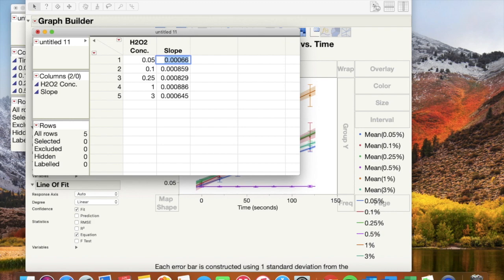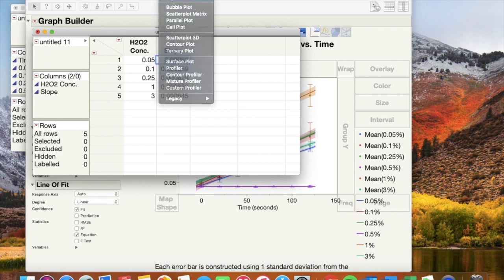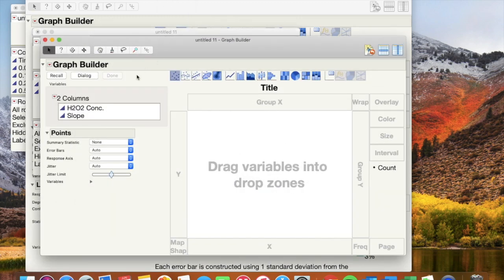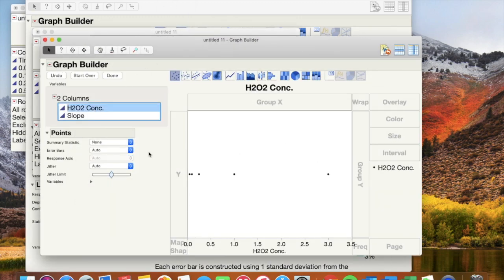Go to graph builder and don't forget to change sig figs and modify the graph as shown.